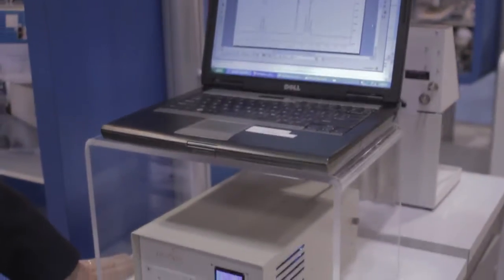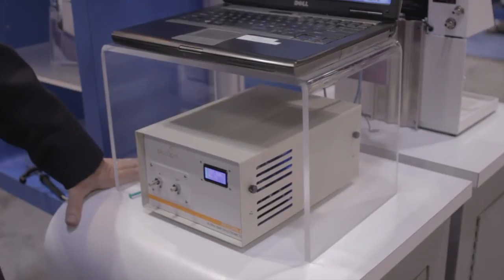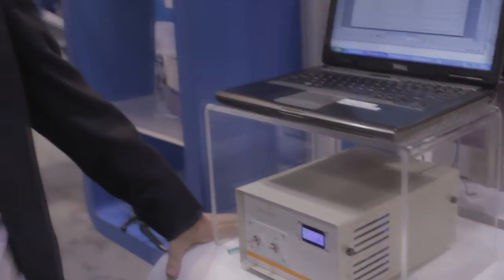This machine is in every way like an ordinary NMR spectrometer that might cost 10 or 20 or 50 times more. It produces the same kind of data. And you can open up our data using the same data analysis packages that you'd use for a big Supercon NMR machine.